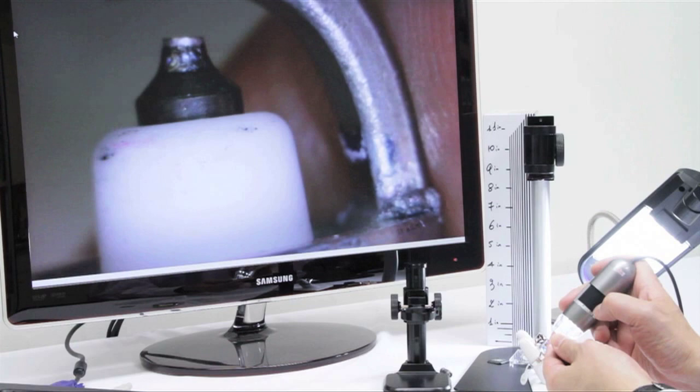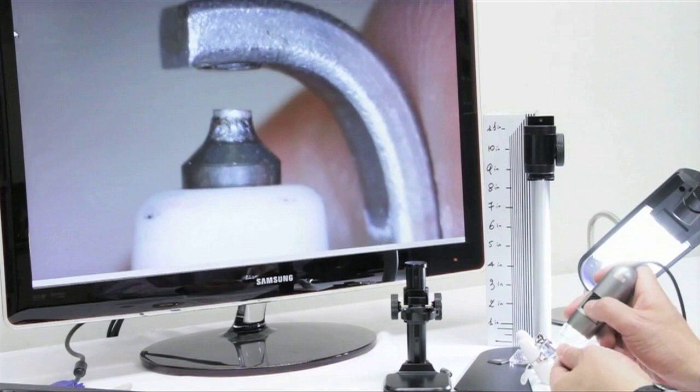There are many different ways you can take a picture. Here we're using the foot pedal accessory that's available.